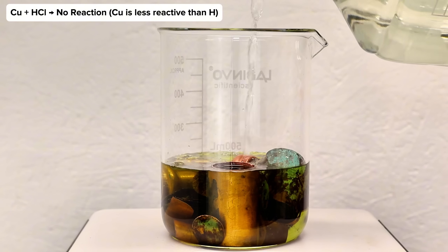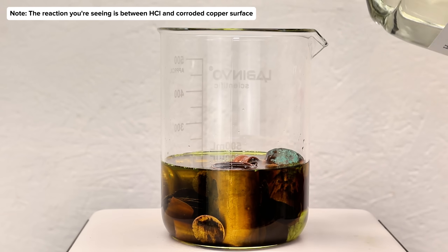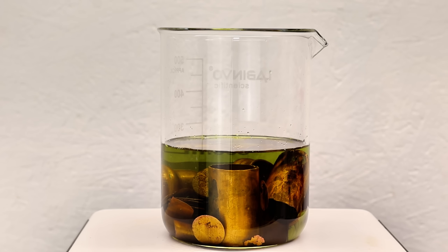If you aren't really pressed for time, the oxygen can be provided by simply bubbling air through the solution using an aquarium bubbler or something like that. Alternatively, you can also add some hydrogen peroxide to the mix, which is what I decided to do.